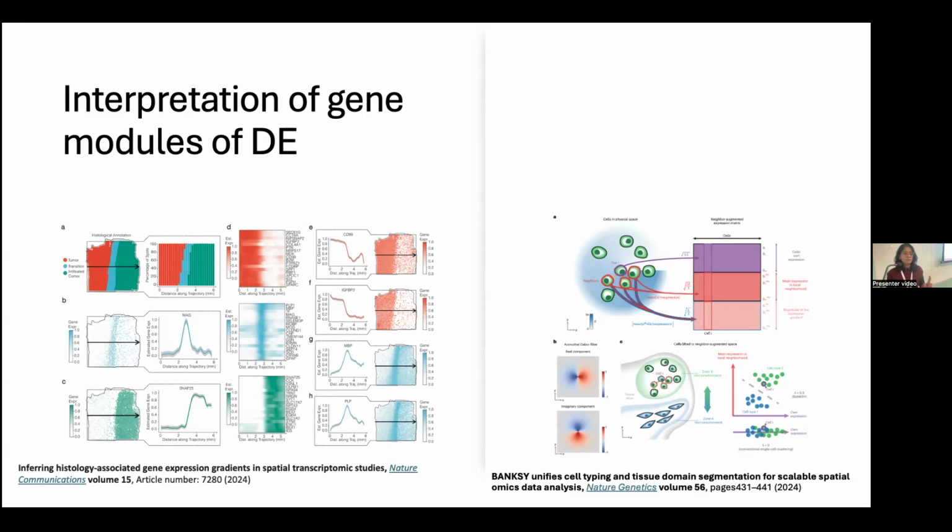And you also have to be careful. You really need to understand what is the output from your spatial clustering. So with Banksy, the output is actually, you will find that your matrix has increased by times 3 because it appends the neighborhood average gene expression and also the Gabor filtered gene expression gradient matrix to it.